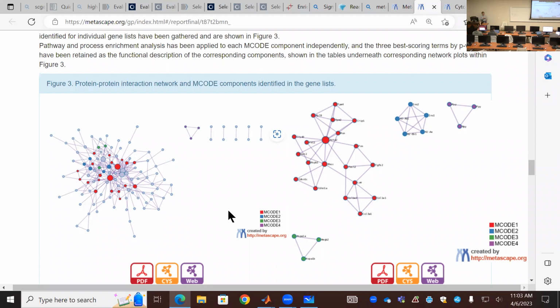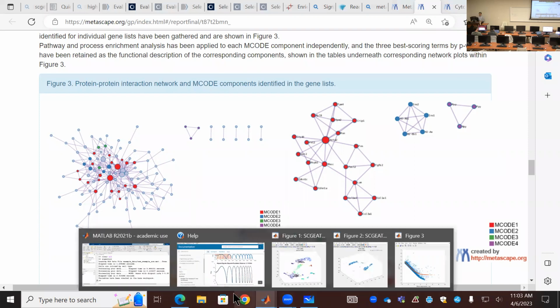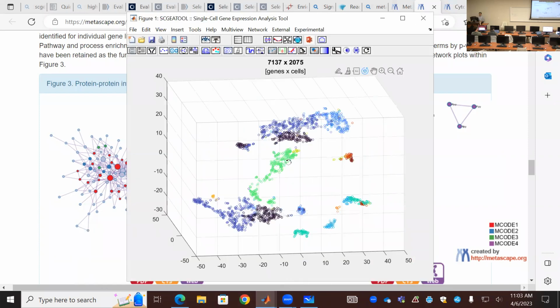In our case, we're using highly variable genes to see what the alpha cell is doing in its active state. Okay. So we will take a 5-minute break and come back to use another method to detect highly variable genes. And I will compare, number one, whether the 200 genes detected by this method and that method, how much overlap there is between them, okay? And then we do the functional analysis again and see whether there are differences.